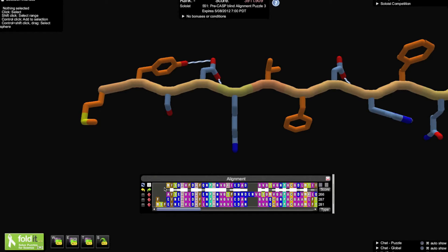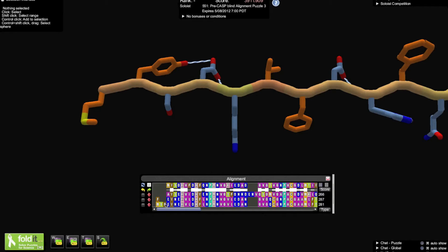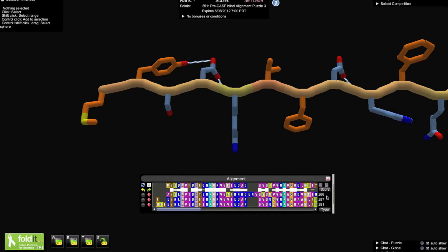When the alignment tool is opened, it will show several amino acid sequences. The top sequence is the protein of interest, in this case, a CASP target. Though the sequence of this protein is known, the structure is not. The sequences below are three proteins that are predicted relatives and have known structures. These three potential relatives are called templates. The alignment score which predicted them to be related to the CASP target can be seen on the right.